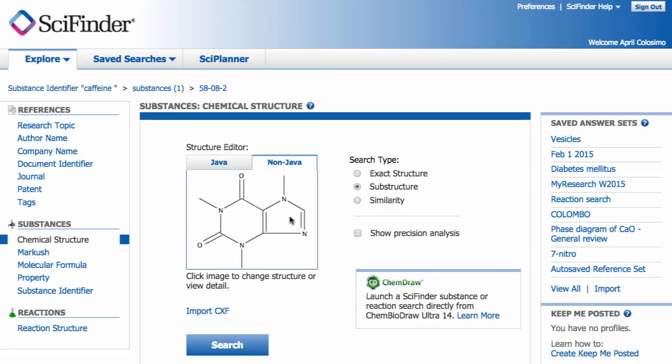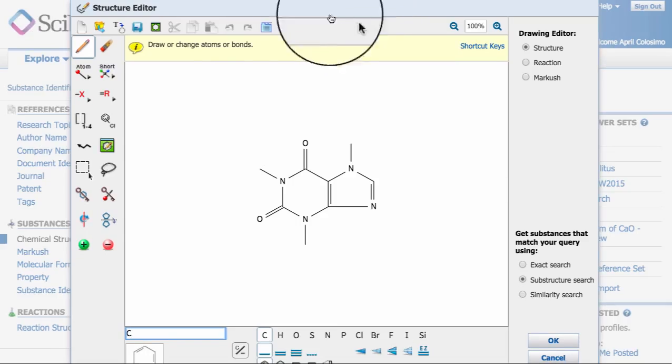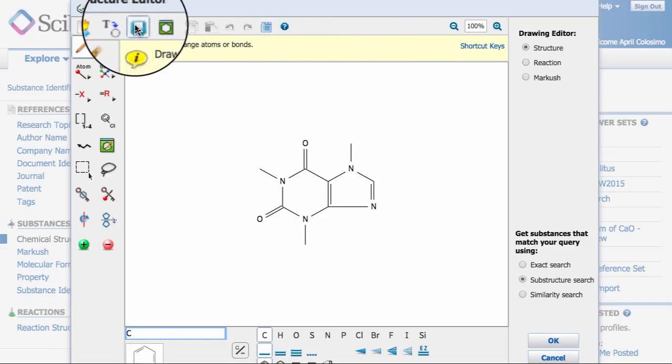Clicking on the image brings up the editor. One last step to export the structure is to click on this old image of a floppy disk.